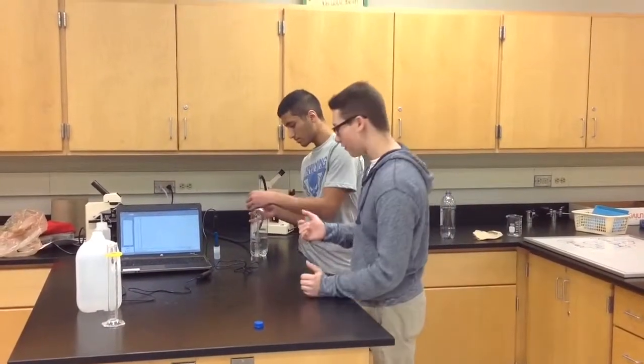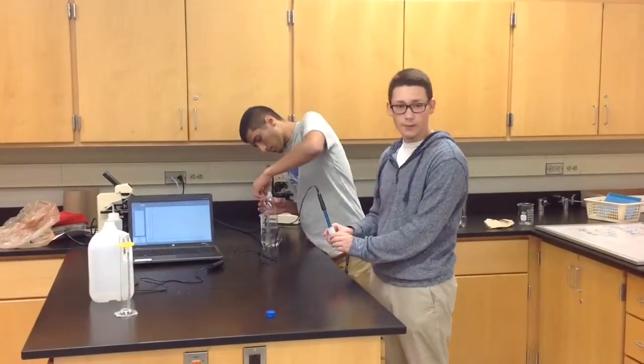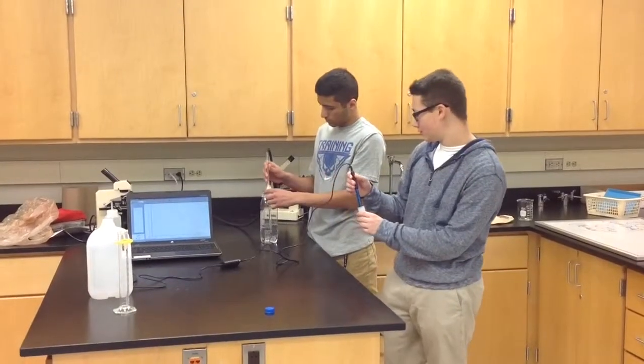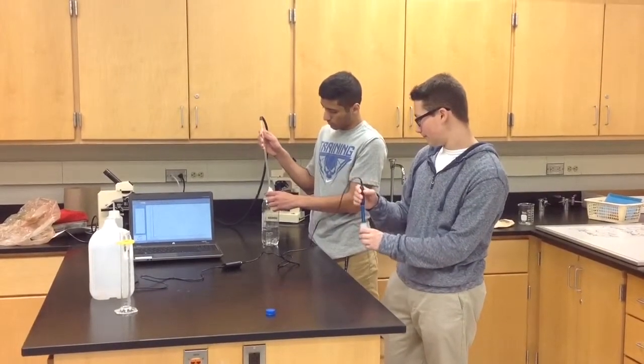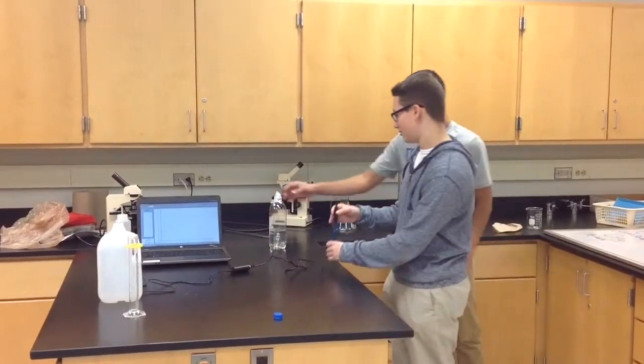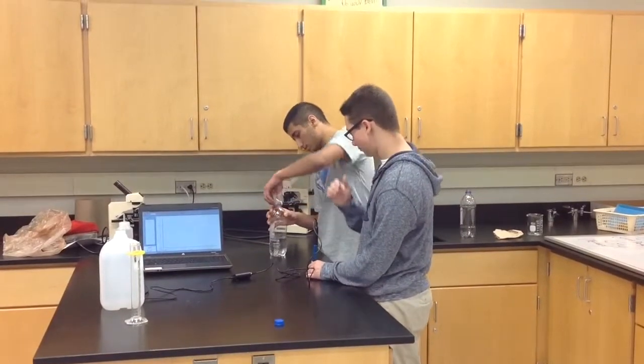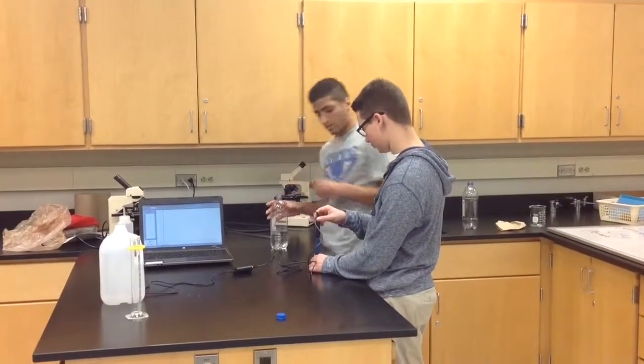Okay, so now Arhan's taking off the paraffin, and I'm grabbing the pH meter, with which I will measure the pH change of the water. Okay.